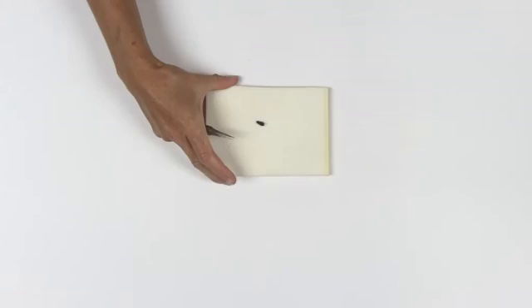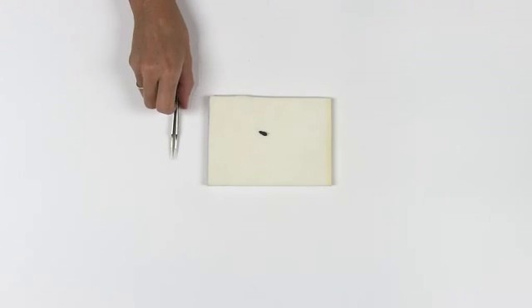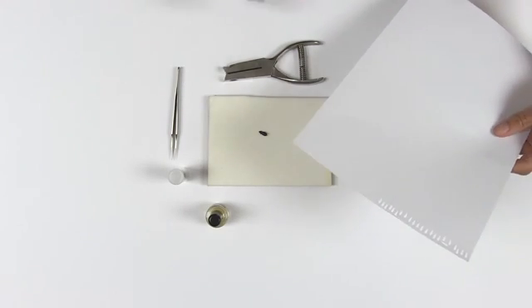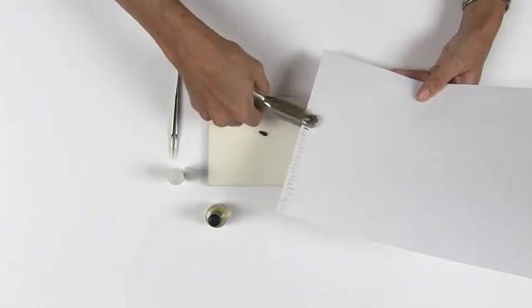To pin very small insects, another option besides double mounting on a micro pin is sticking the insect on a paper point. You will need a piece of foam board, fine tipped forceps, a hole punch, a number one insect pin, some clear nail polish, and a piece of thick white paper. Use the hole punch to cut out a triangle of the thick paper.